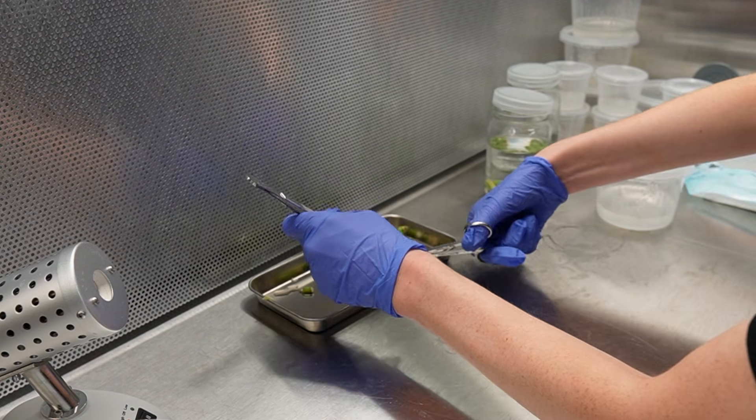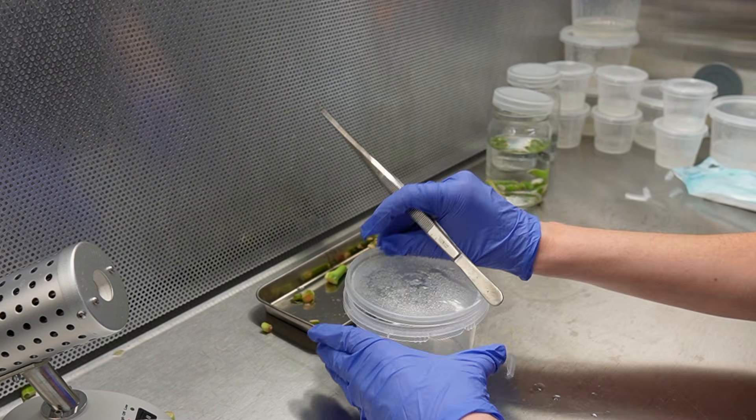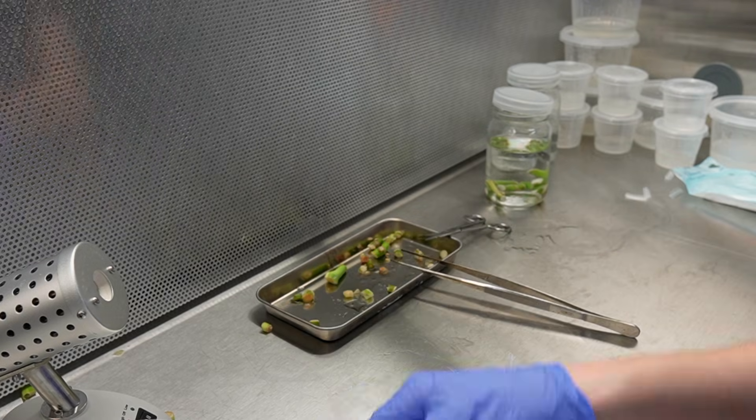I'm going to be improving the angles here. I didn't film the pseudolithos but I didn't do anything special to it — I just took it out of that water and plopped it straight into the media.